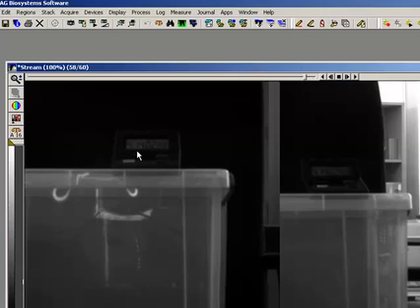Let's move on a bit further. 4:14:02. Let's go one more frame forward. 4:14:02:84, that looks like to me. So the cameras are actually very well synced together, even though we're not using any triggering or any methods like that. So I hope it's been of use.